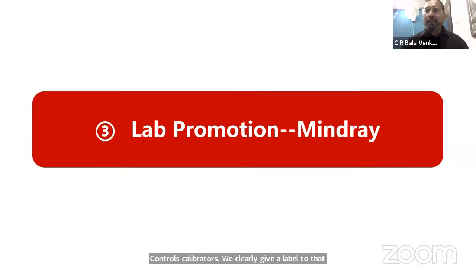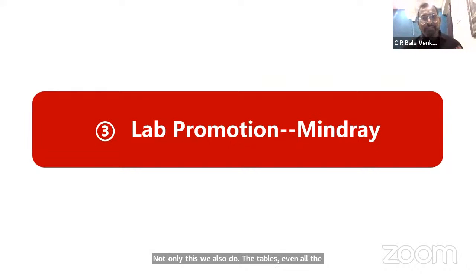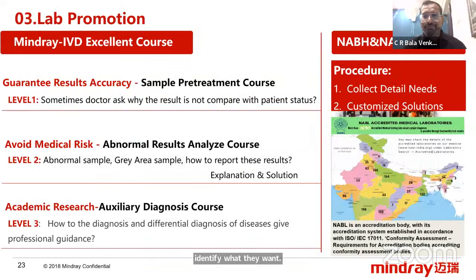Next one. Not only this, we also do the tables. Even all the tables are marked with what is inside. So even the tables are clearly defined. Whoever comes into the lab without any knowledge, any auditor who comes, can rightly pick the records or the document, whatever it needs. It will be crystal clear: patient data, open, and you can take. So everything is labeled, so that even the routine work will not be hampered. They can easily identify what they want.